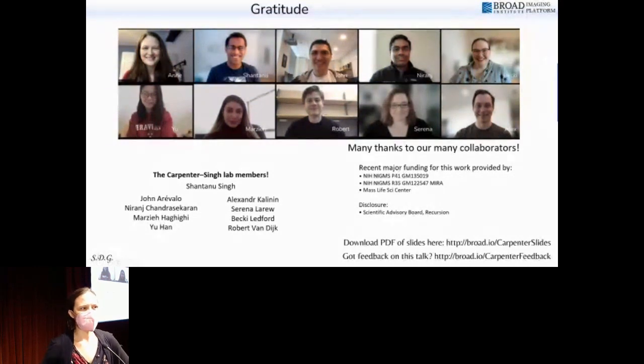Oh, wow. Yeah, absolutely. Not just fruitful, but 100% necessary. I would say there's very little innovation that's been done on the biology side of this equation. For the most part, the entire field of image-based profiling takes methods that have proven effective in general computer vision tasks, which is much better funded and staffed. We just adopt them, maybe adapt them to some degree, and apply them. I'm especially excited about developments in contrastive learning, which seem most promising for our field. But for the most part, we are on the receiving end.